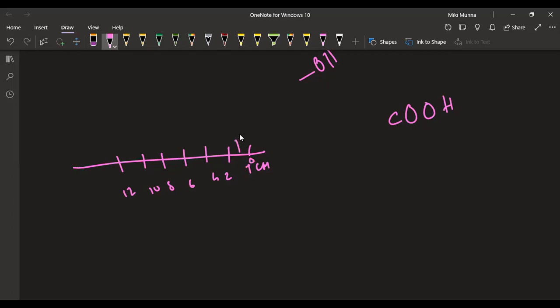We found there was this triplet over here, and we are able to find that this was due to the presence of our CH2 group. That means the adjacent carbon to the one whose environment we are finding has a CH2 group. Fine. However, we also have a group which is this portion.